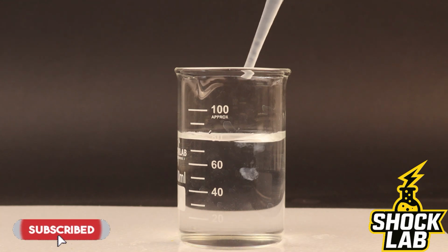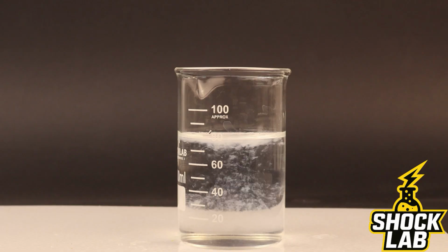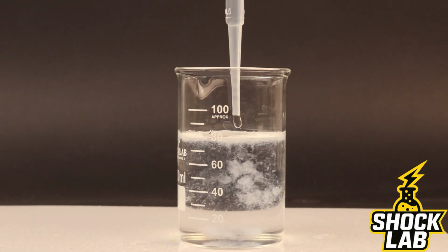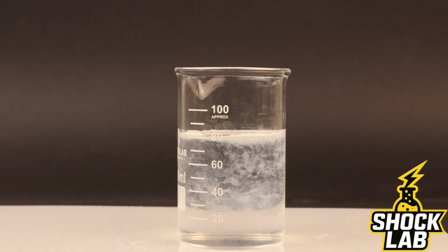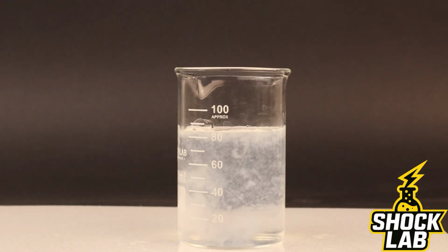Today we're exploring a simple but fascinating reaction between aluminum chloride, sodium hydroxide, and hydrochloric acid. We begin with a clear aluminum chloride solution.